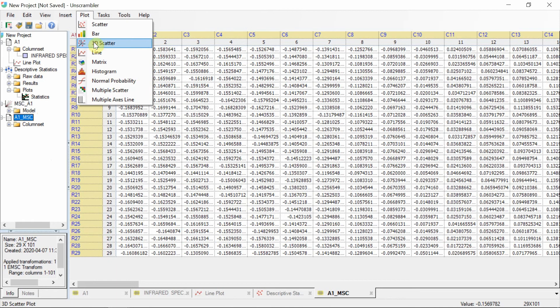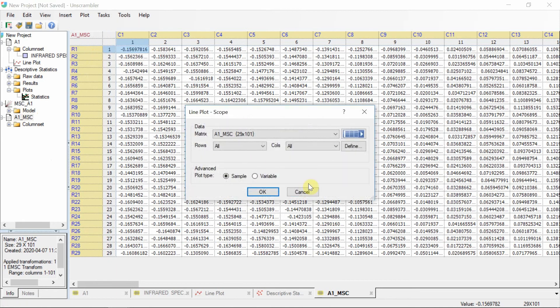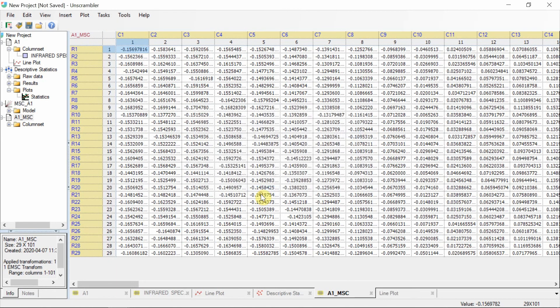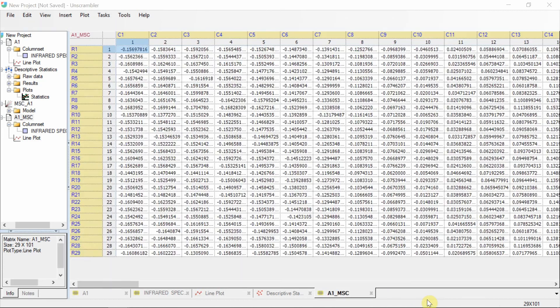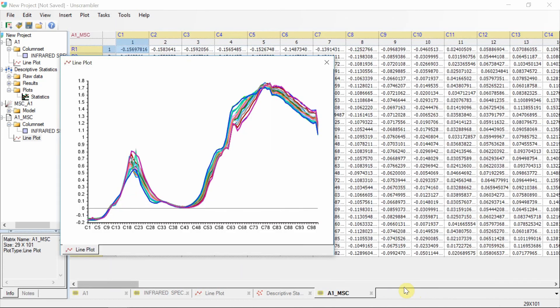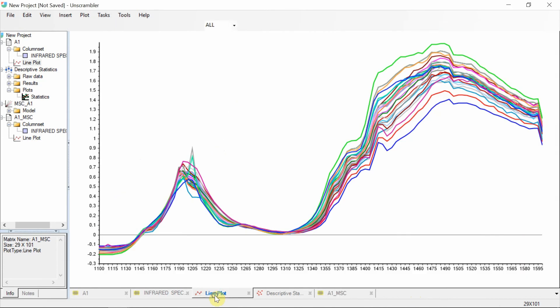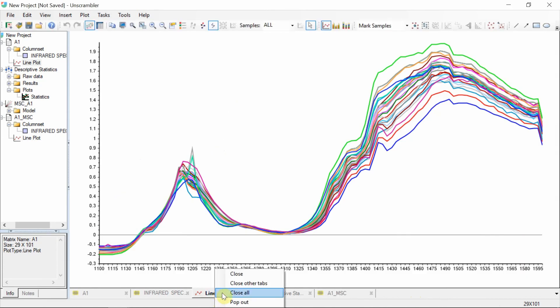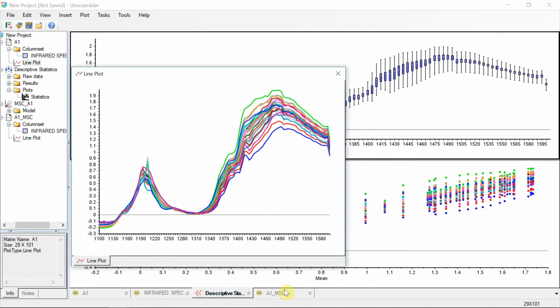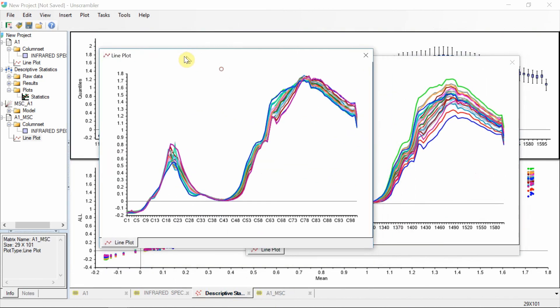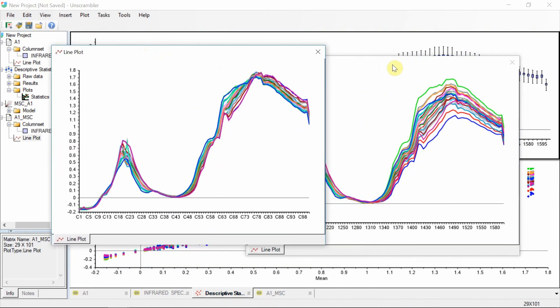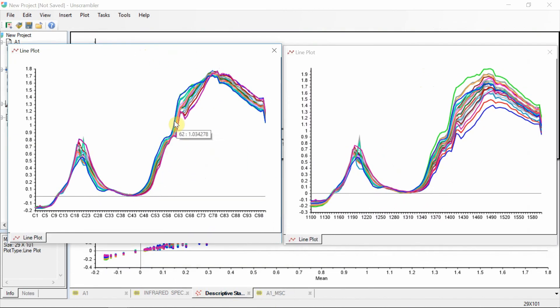Make a line plot of the transformed spectra and pop it out in a separate window. Do the same for the line plot of the raw spectra to compare these side by side. The scatter effects have been reduced with the transformed compared to the raw spectra.